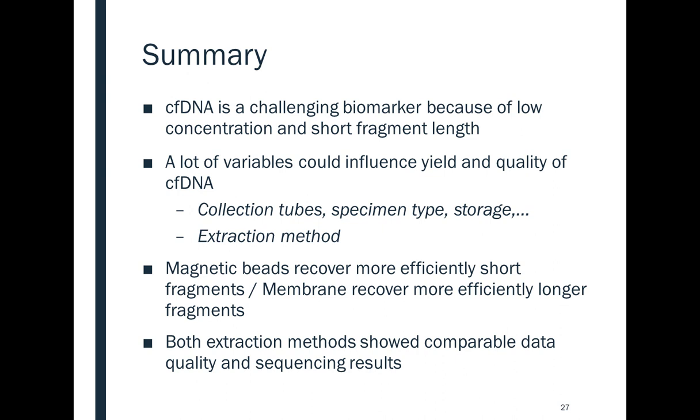Thank you. Is your method automatable? Both kits I used in this comparison: the QIAGEN kit is semi-automatable, so it's done with this vacuum container, and then it could be isolated using the QIAcube. And the Sera extractor beads are fully automatable.